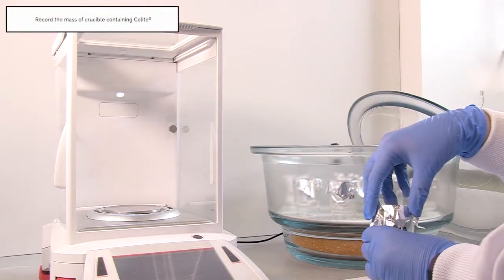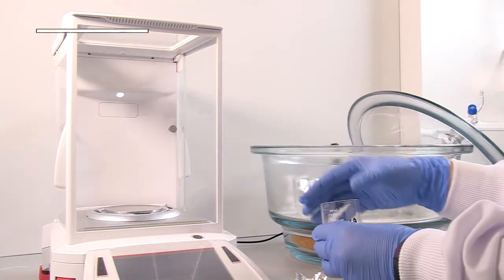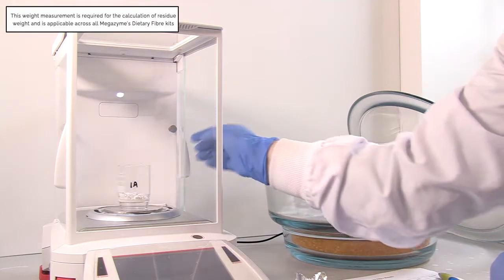Weigh the crucibles containing celite and record this weight. This weight measurement is required for the calculation of residue weights.